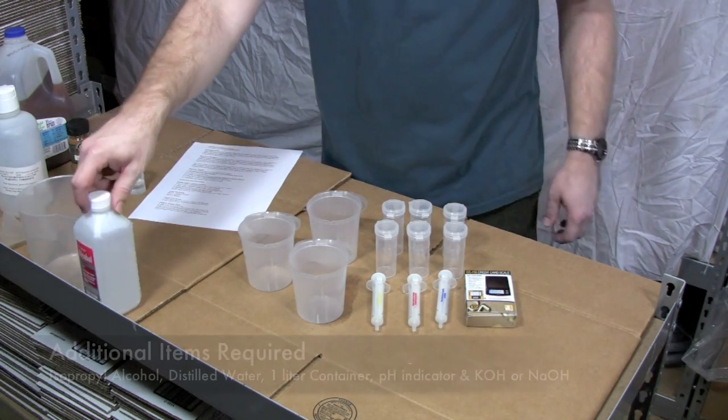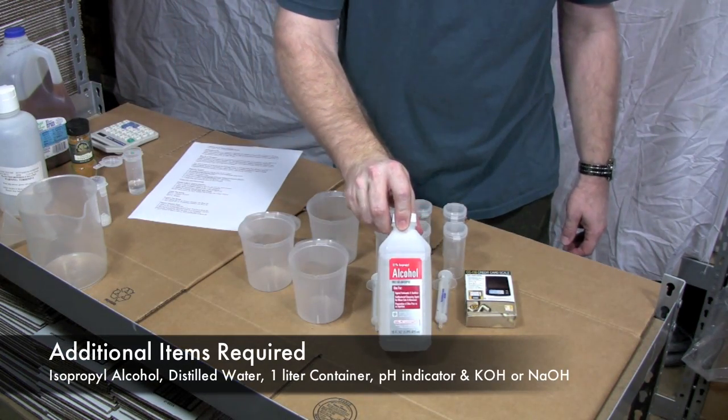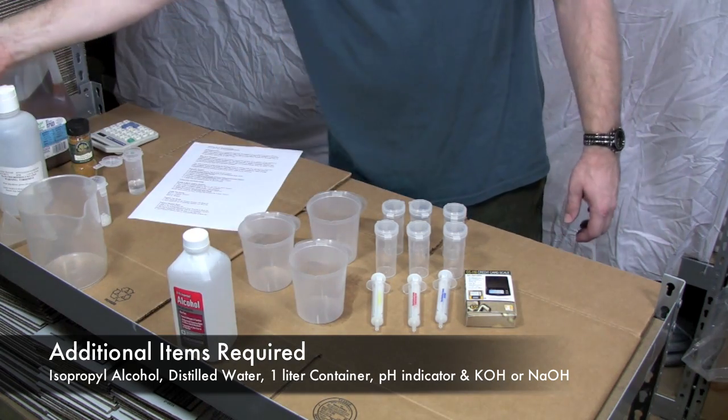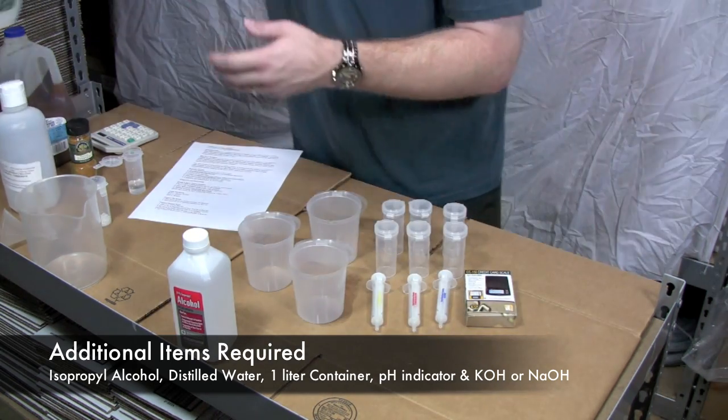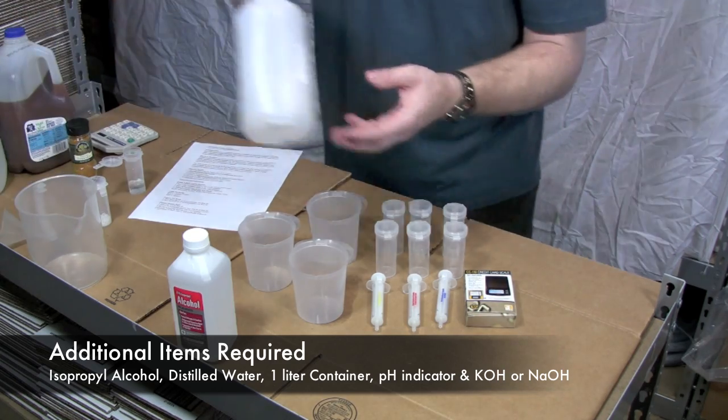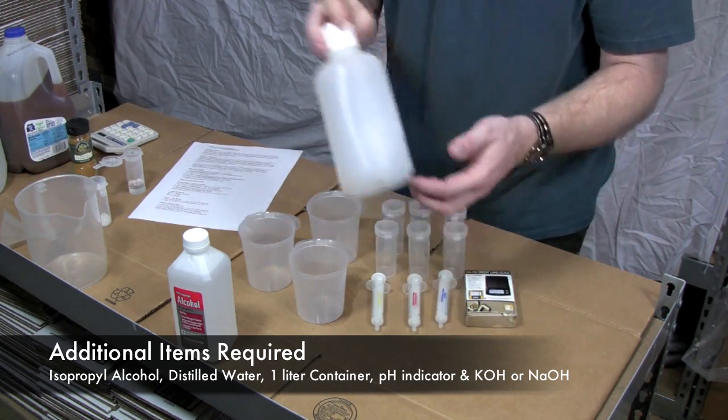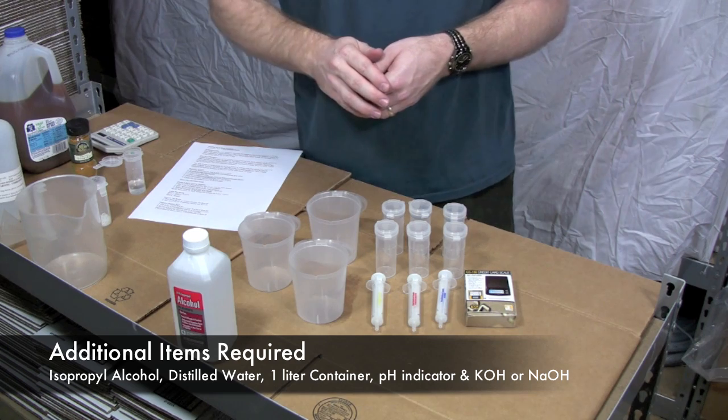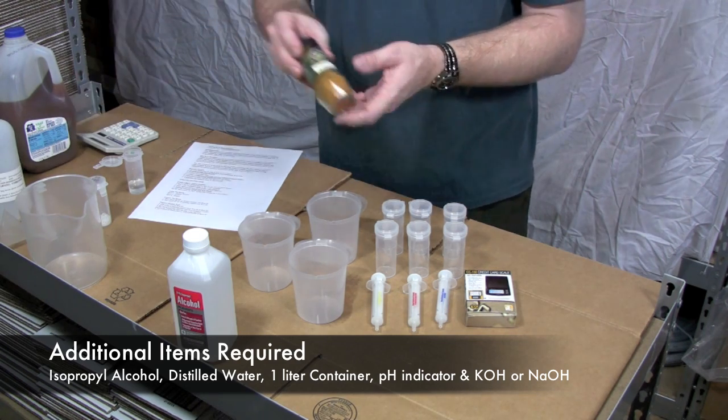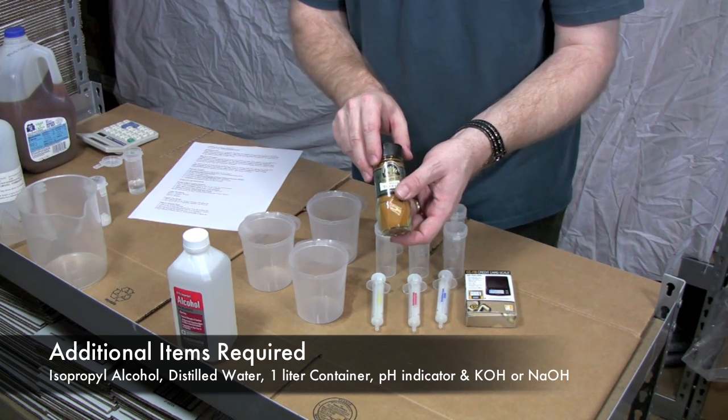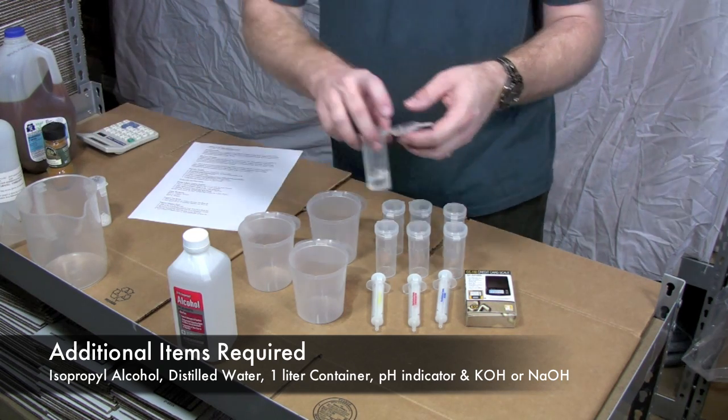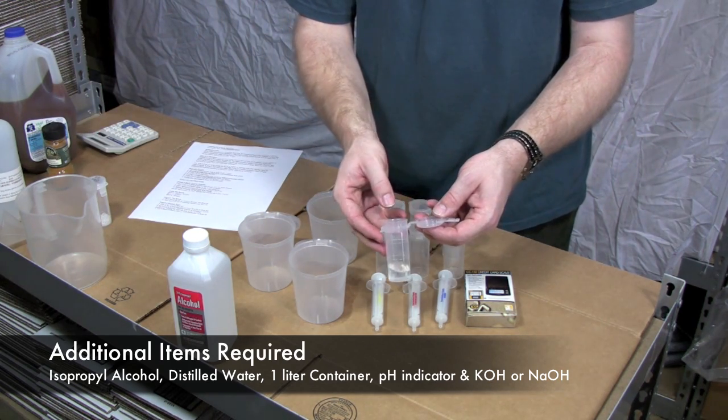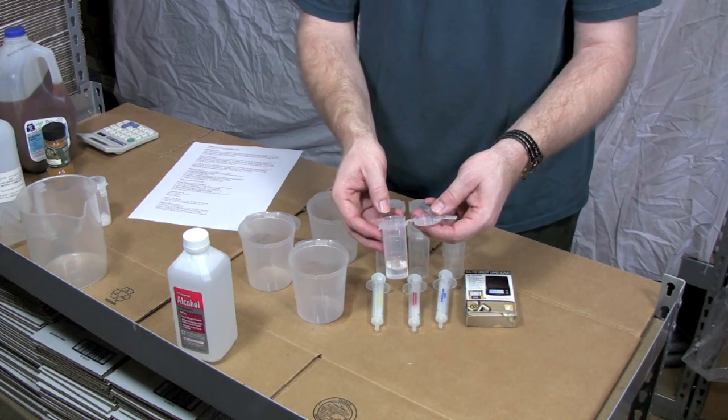What you'll need to purchase in addition to this kit is some isopropyl alcohol, some distilled water and a container that can hold one liter of water. You'll also need for a pH testing solution either turmeric powder that you can pick up at a grocery store or phenolphthalein that you can purchase online through Utah Biodiesel Supply or other vendors. You can also use phenol red.